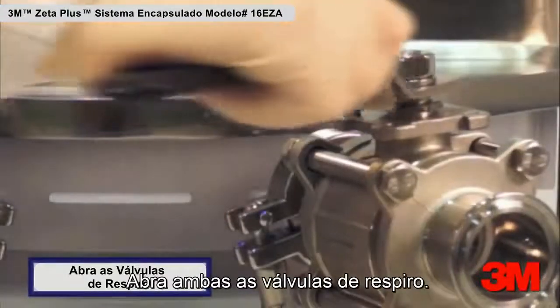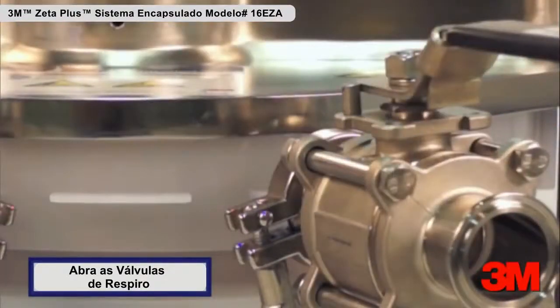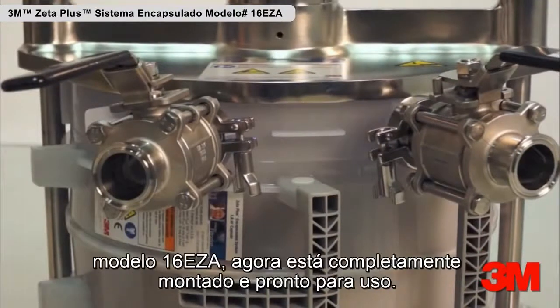Open both vent valves. The Zeta Plus Encapsulated System model number 16 EZA is now fully assembled and ready for use.